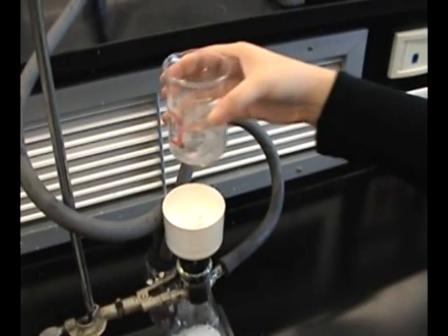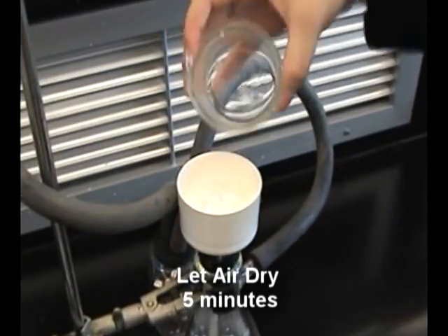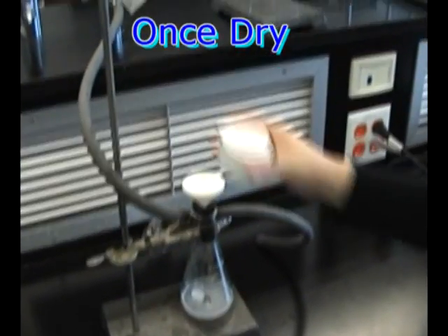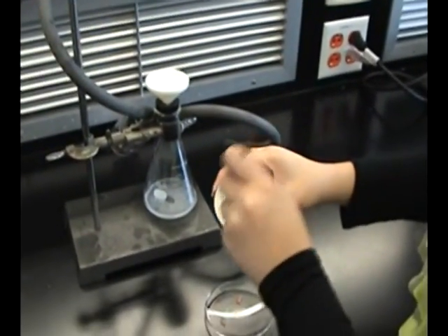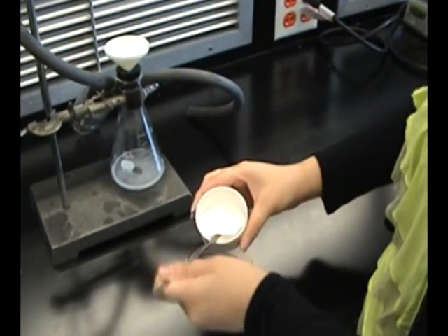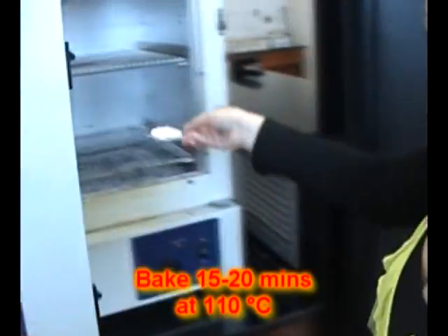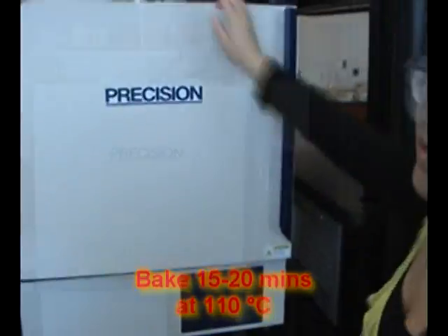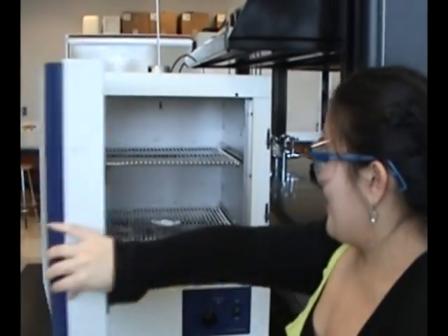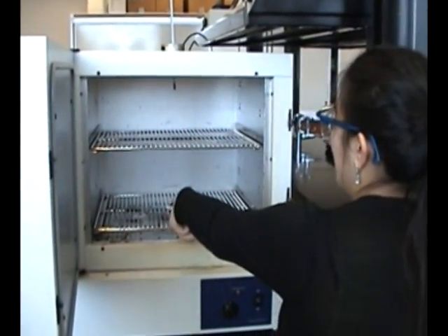The reason why we use ice cold water is because we do not want to dissolve our sample again. Remove the filter cup and transfer the isolated crystals with the filter paper onto the watch glass. Once time is up, open the oven and use test tube tongs to get your watch glass out.